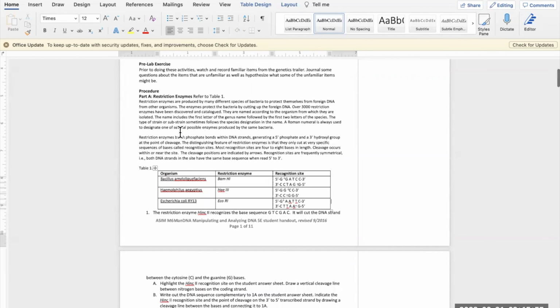Nice. Okay. Let's see if it's the same. We're going to start at the end of the slice. 1, 2, 3, 4, 5, 6, 7. So for the first fragment, we have 9 base pairs, and the second, we have 7. Alrighty.